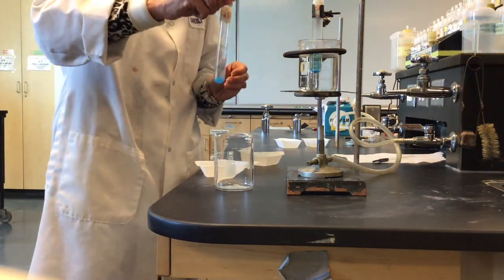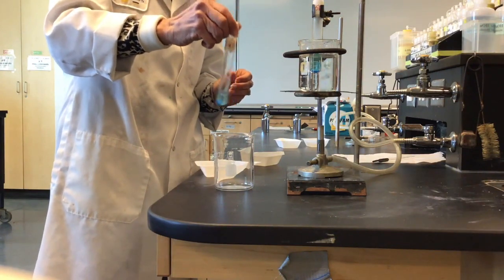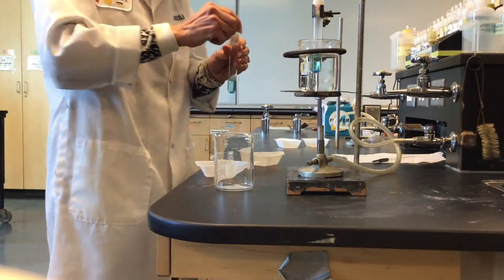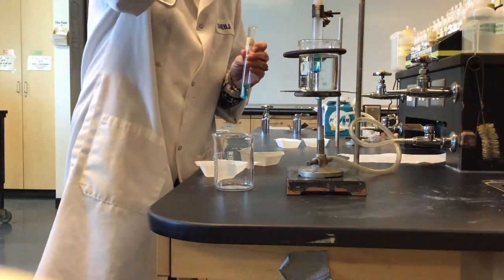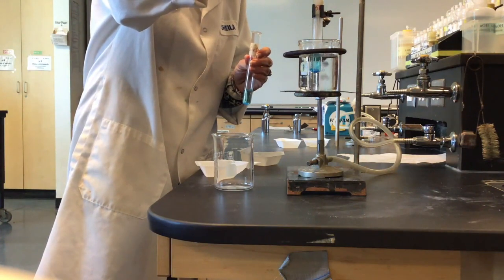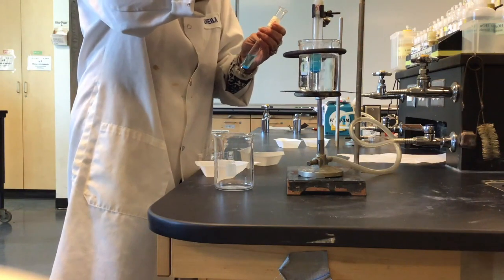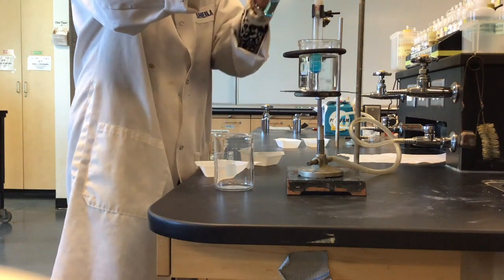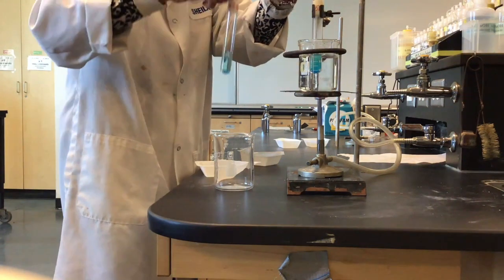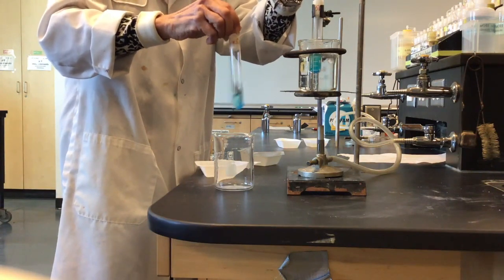Again, we're going to go ahead and try to dissolve that. And we can use a stirring rod to help us, for the one in hot water, and we can stir the room temperature water.